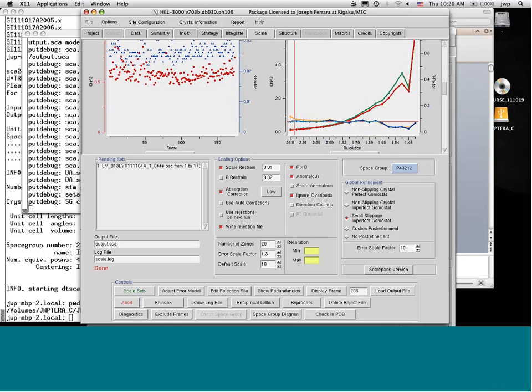All reflections belonging to reflection off of, say, one side of the reference planes in the crystal, I pluses, are treated together. Combined is not the right word. And all the I minuses, by reflection off the opposite side of the plane, are treated together. If you have only normally distributed random errors, this line should be close to 1, which would be right here.